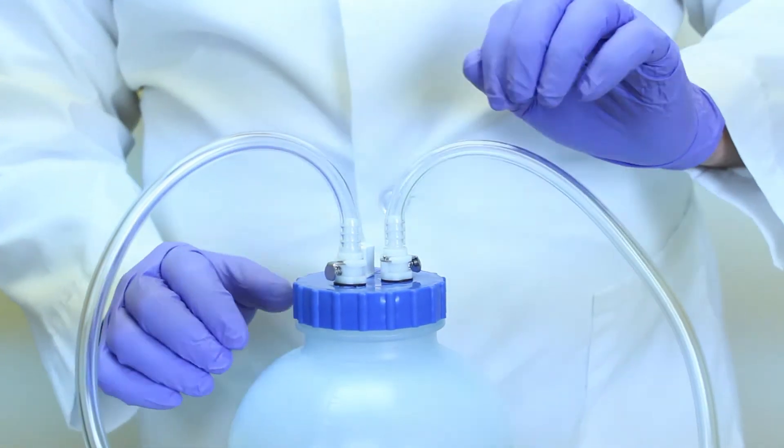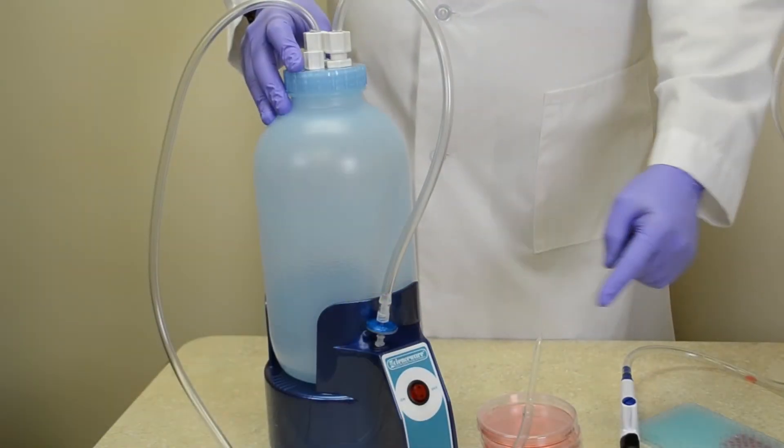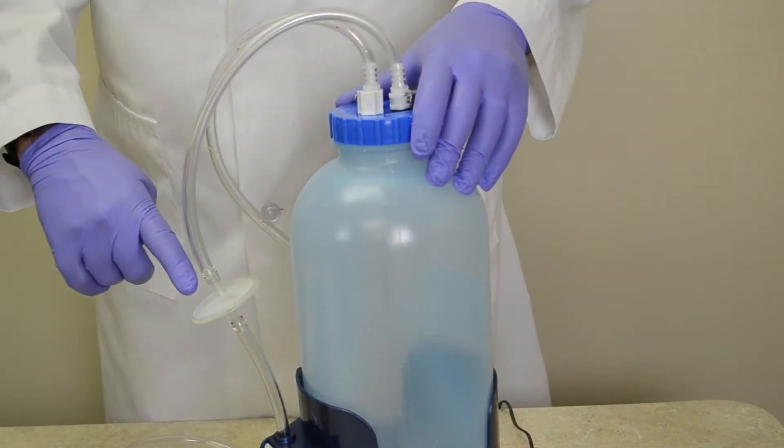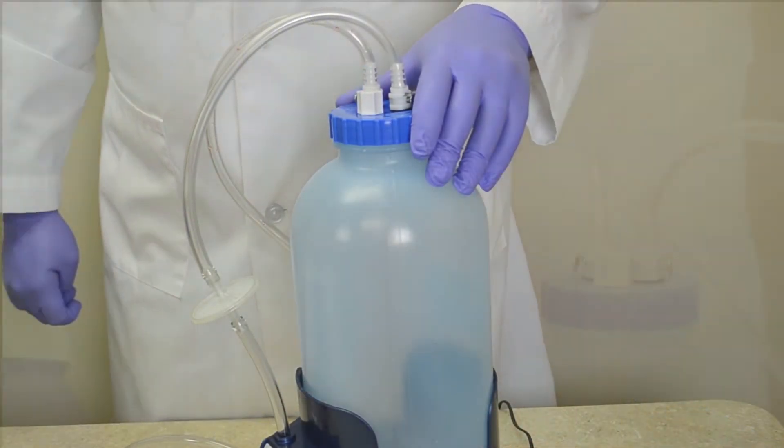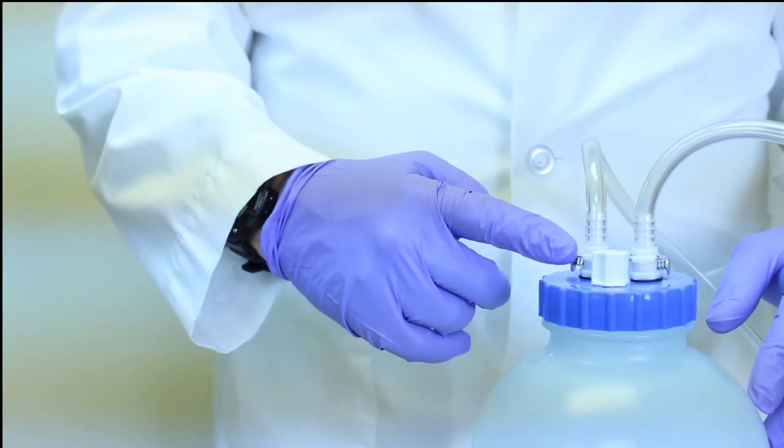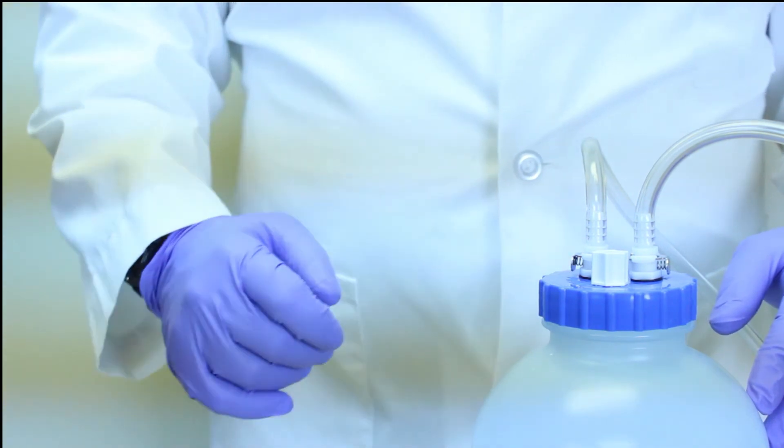Both models quickly and conveniently aspirate fluids and have a replaceable hydrophobic filter to protect the pump motor from fluid contamination. They also feature a safety release vent to prevent vacuum implosion of the bottle.